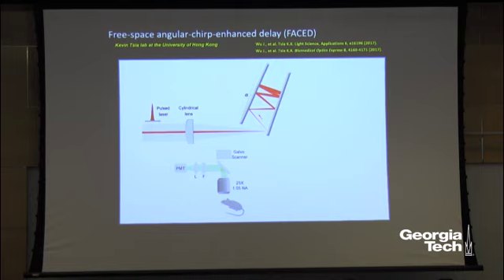If the 2 mirrors are perfectly parallel, it will just go all the way out, right? But because of this very small angle, the incidence angle onto those mirrors keeps decreasing until at one stage, on one of the mirrors, the beam will be perpendicularly incident. And when that happens, it will bounce back. And then if you have a beam splitter here, you can send this beam back through the microscope and form a focus inside the mouse.